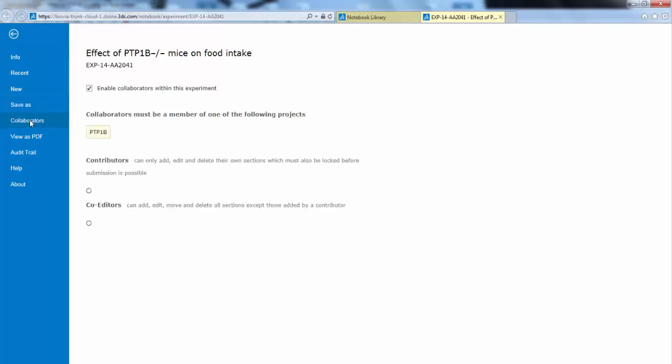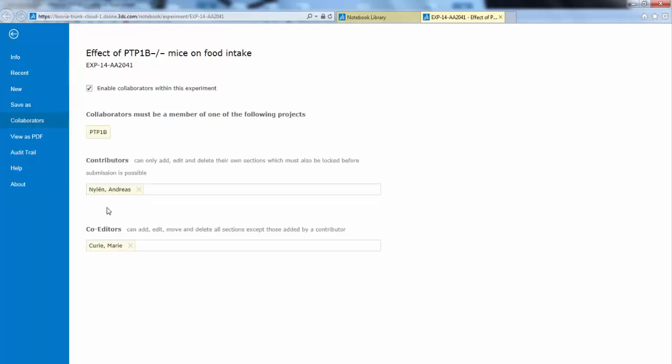You can select collaborators as before, as contributors, or as co-editors. You can view the preview, the experiment as PDF, and you can see the audit trail.